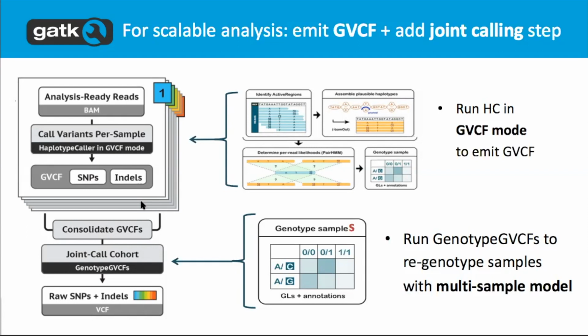It's basically the same system where we spent a lot of energy looking at variant sites to provide statistics to accompany our variant call. But we do a similar, though lighter process for non-variant sites, so that for each non-variant site, we can have an estimate of how confident we are that it's actually non-variant versus just not having enough data. And we'll go over that in the next talk.